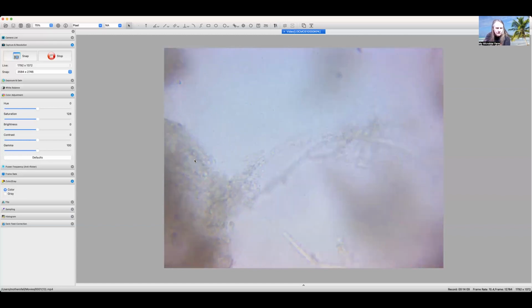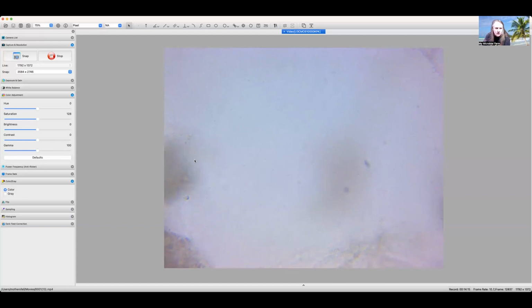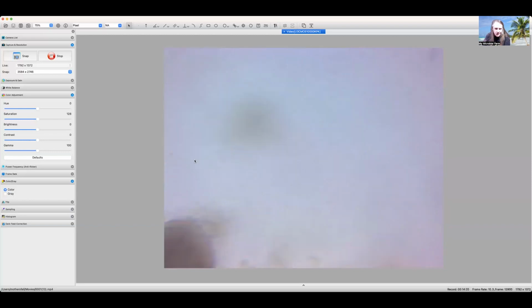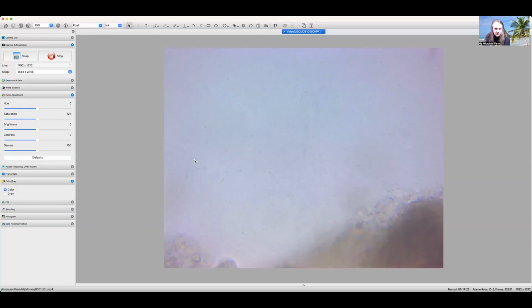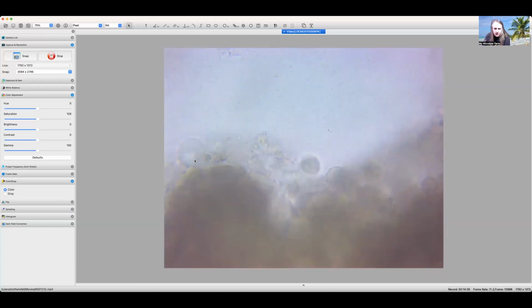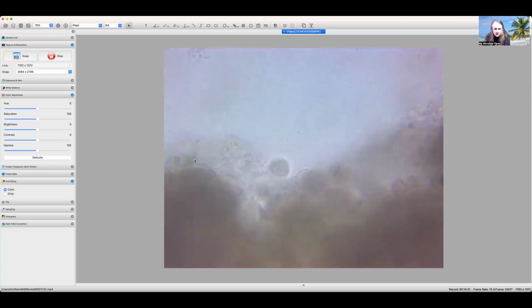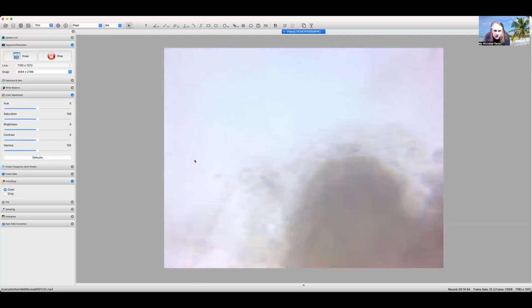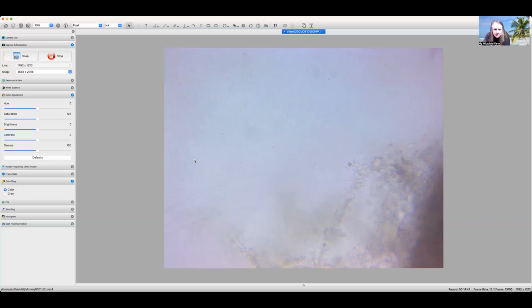Okay, so that almost looks like a naked amoeba there, but it's not moving. So I didn't realize there was so much life in that bucket. It just looked like one thing growing. But then now you zoom in on it, and there's just so many of these things. A goblet of them. Whatever that one is, it's kind of cloudy.